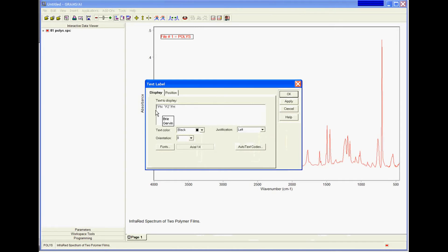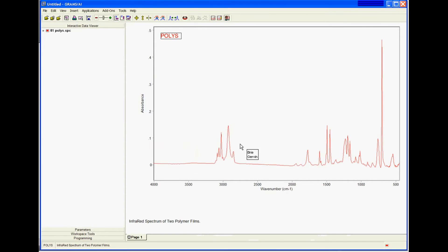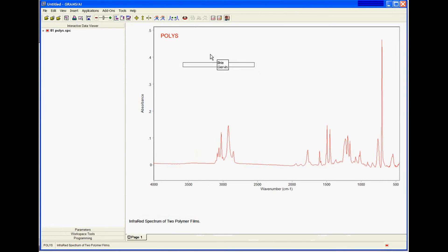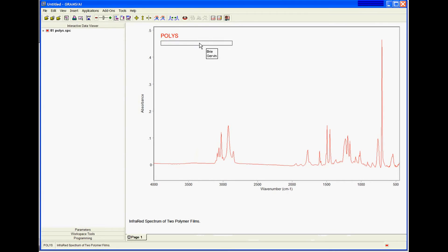I'm going to remove some of the text and I'm going to add my memo field right below it.